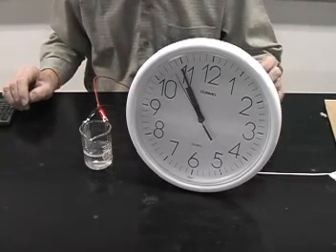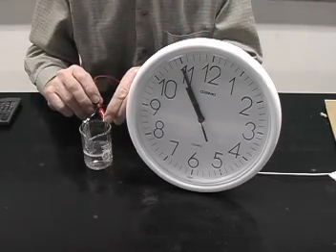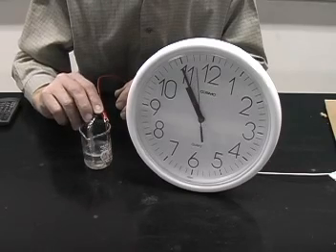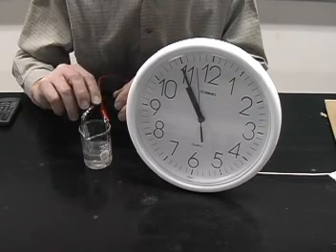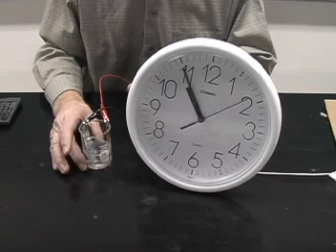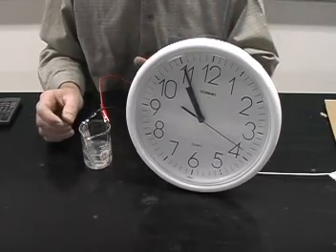Here's my clock powered by an electrochemical cell. I've got a piece of copper wire and some aluminum. And if I stick that in the solution here, the clock begins to tick. Now, this reaction does not run very long, but nevertheless it shows that I'm producing an electric current that can be used to power a clock.